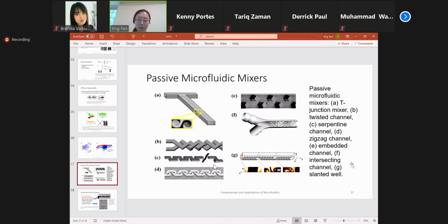So people designed so-called microfluidic mixers that make use of both diffusion and chaotic mixing. Chaotic mixing is different from turbulence, because in microfluidic devices the Reynolds number is not high enough to have turbulence. But still, the streamlines are highly chaotic with some vortices.